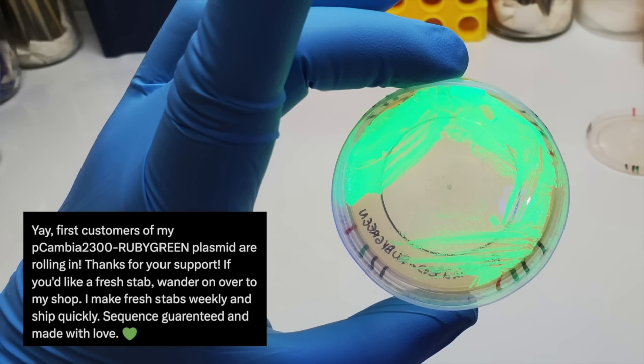Fascinating. How long do the plasmids store for? So in agar stab forms, they actually store a really long time. Like the longest I've had was 5 years. Oh, just pulled. Yeah, I had a tube in the back of a drawer and I said, okay, let's see what happens. I forgot about it. And then I poked it with an inoculation loop, struck it out on a plate, and it grew. And so if you don't open the tubes, they last for years. If you open the tubes, I think you can double dip maybe twice before the cells start getting damaged.